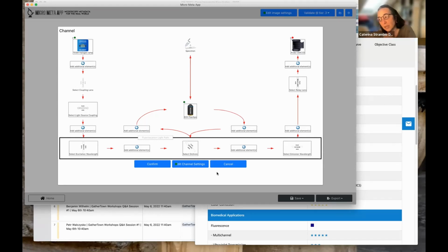At some level, the idea is that we want to be able to capture this information for the data. It doesn't take very long to enter this information for one image, but it would be really terrible if you had to repeat it for each image in a data set. So we want to make sure that it is propagated across the data set.